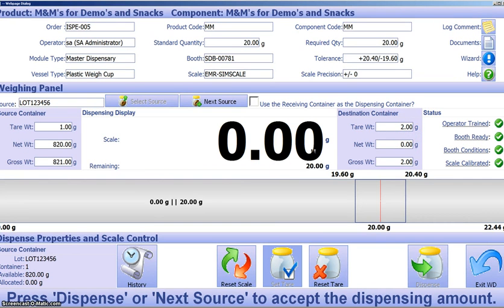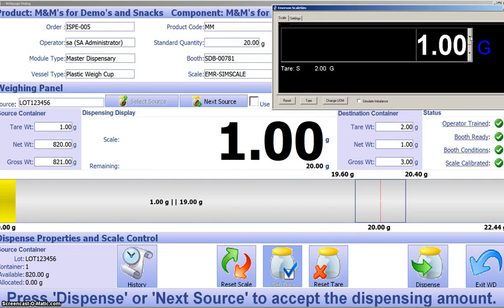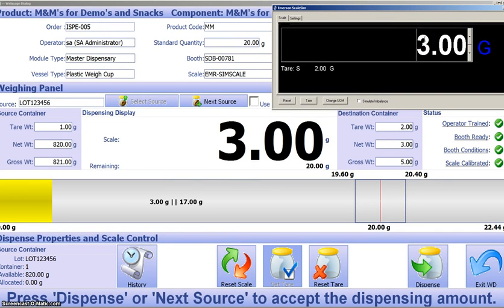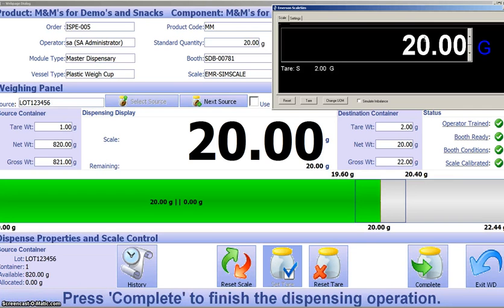Now, as we start to dispense our M&Ms, we're going to see the bar start to fill up as the system reads the scale. Now, right now it's yellow. And if we were to over-dispense, it would turn red. You notice this is relatively large font, bright colors, easy to see from a distance. But of course, we've got great operators here today, so we're going to hit that 20 grams right on the nose. The bar turns green, which shows that we're within our tolerances.